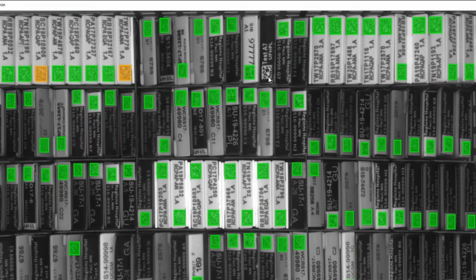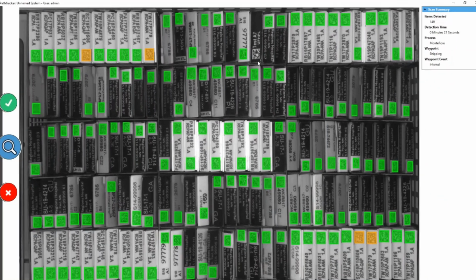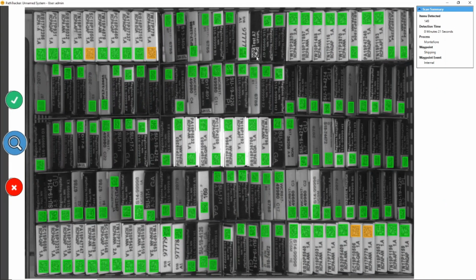There's one cassette in here in the middle of the top row that is what's called an inverse barcode, where the areas that should be black are white, and the areas that should be white are black. Right now, the software doesn't recognize inverse barcodes. That's going to be done before we deliver. It's a trivial issue, but it does give us an opportunity to use the barcode recovery.